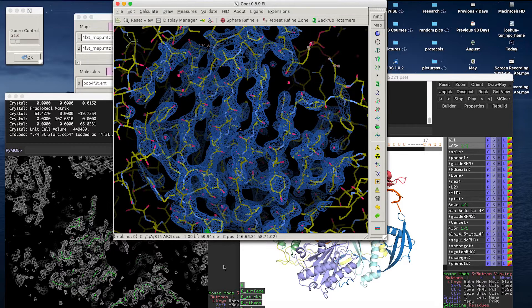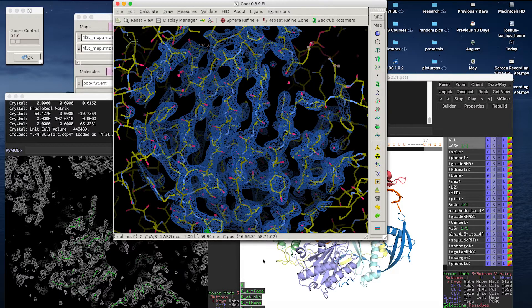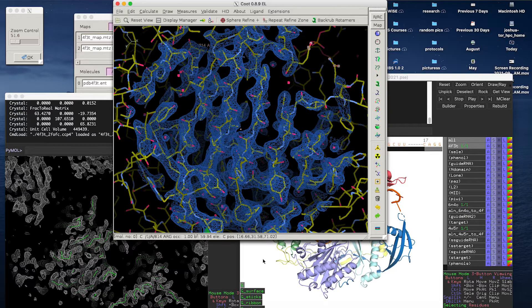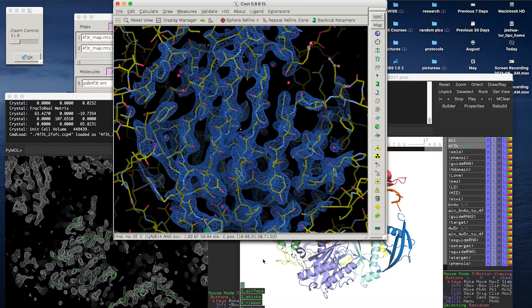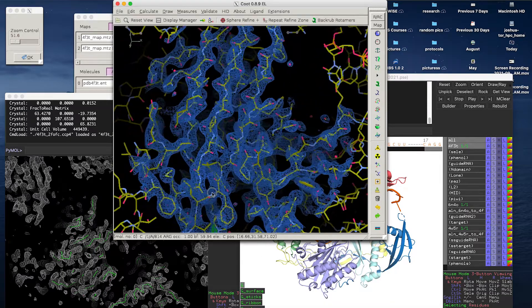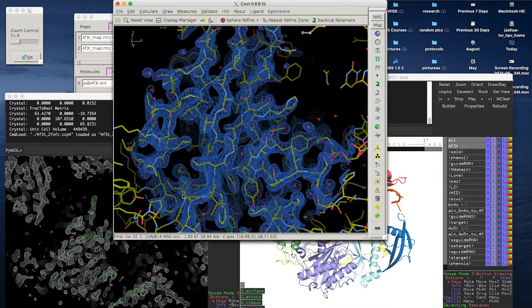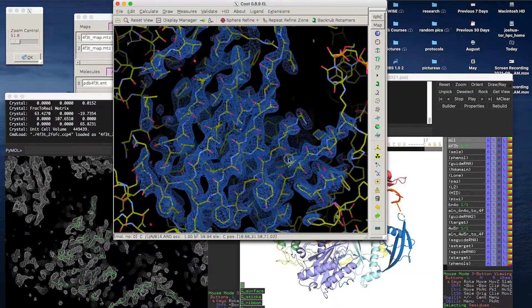This is all showing the same structure. This is 4F3T, and it's a structure of human argonaute 2 bound to microRNA20, solved in our lab by Elad O'Kaim in 2012. And so this is the same protein I studied, but I didn't do this crystal structure.